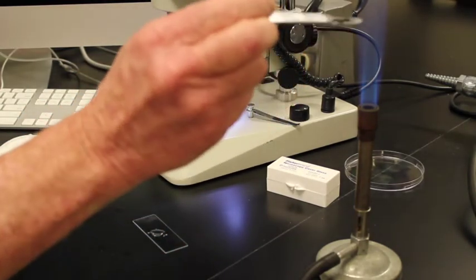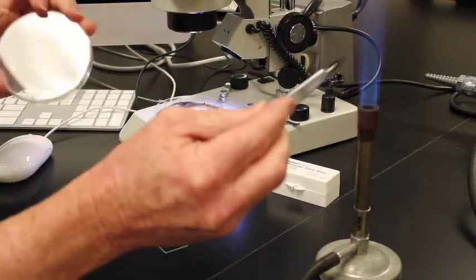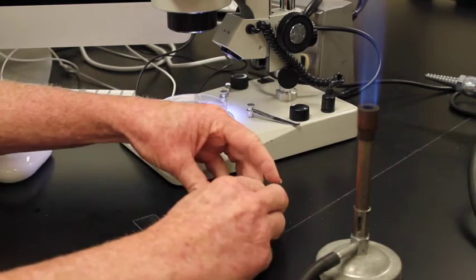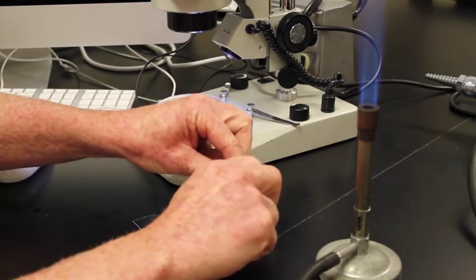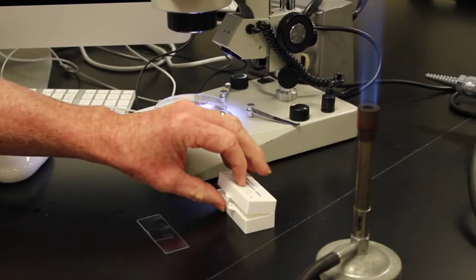Reflame my scalpel so that I don't have any fungus on the scalpel. Put the lid back on the plate. Then I'm going to grab a cover slip. We'll put a cover slip gently on all of these little microorganisms.